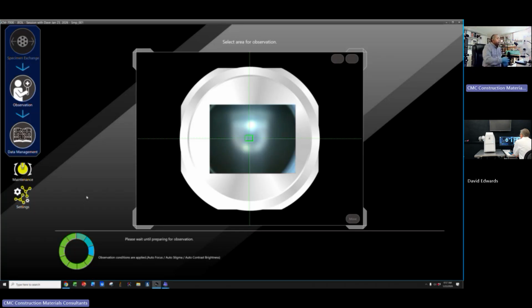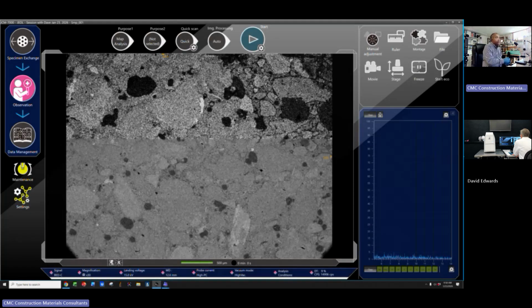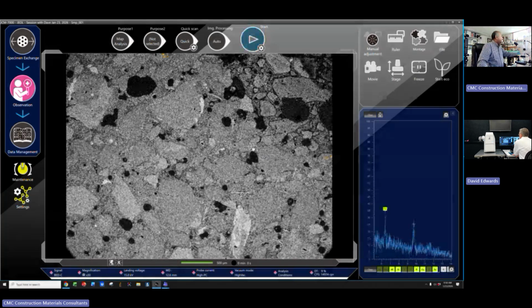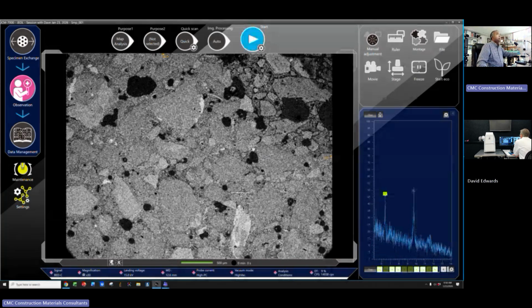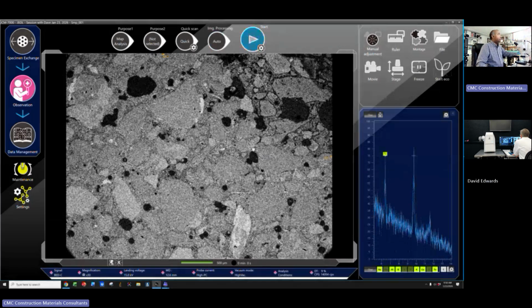Okay, I'm still on. Right. There's nothing in the chamber, or is it your stubs that are in the chamber? There is my sample now in the chamber. So okay. I can turn off the SEM now completely. Right, so I don't have to go to eco mode or anything, right? I can just press off.